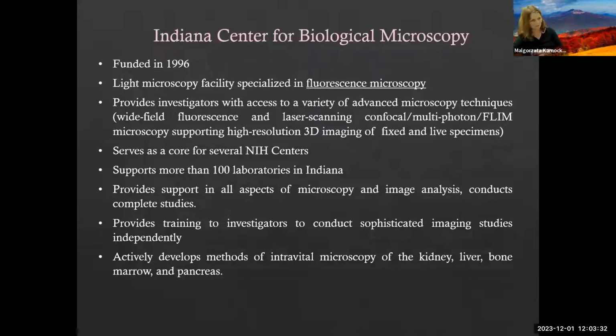It's very difficult to keep count of those, but we are a pretty busy facility, having several systems and offering services like support with all aspects of microscopy. We like helping investigators with designing the experiments and with conducting them. We provide training on microscopes, and we also help to analyze data and interpret them. We actively developed methods of intravital microscopy of several organs, and this is done under the NIH centers which I mentioned.